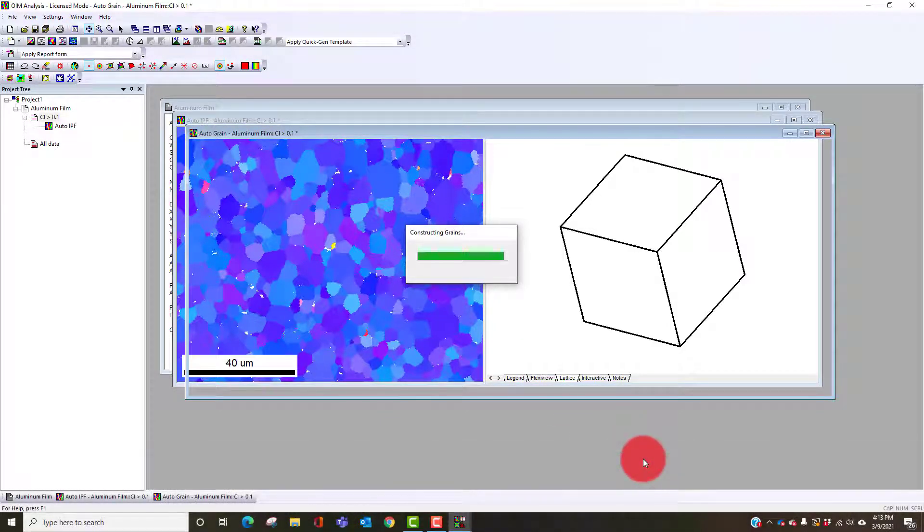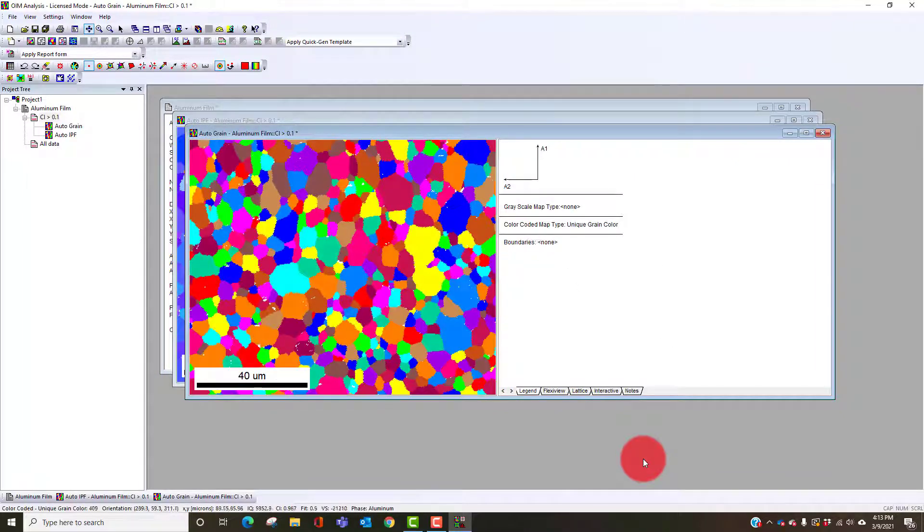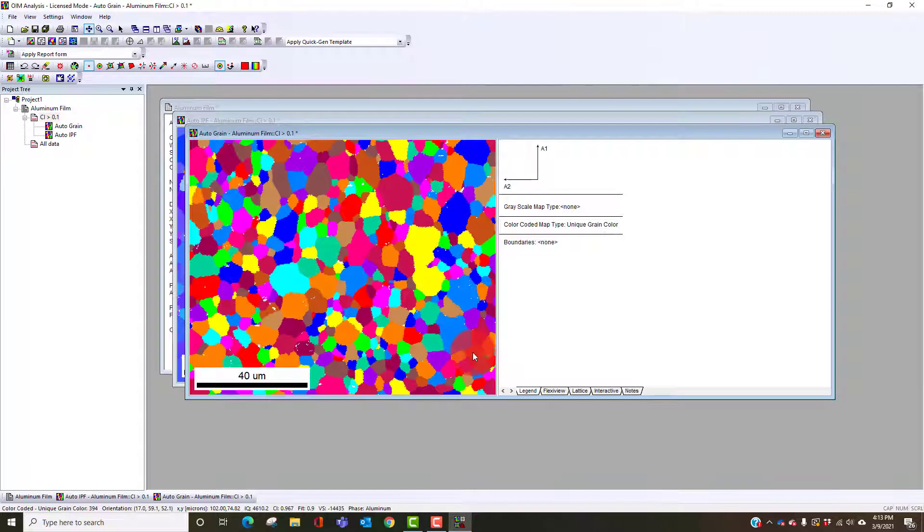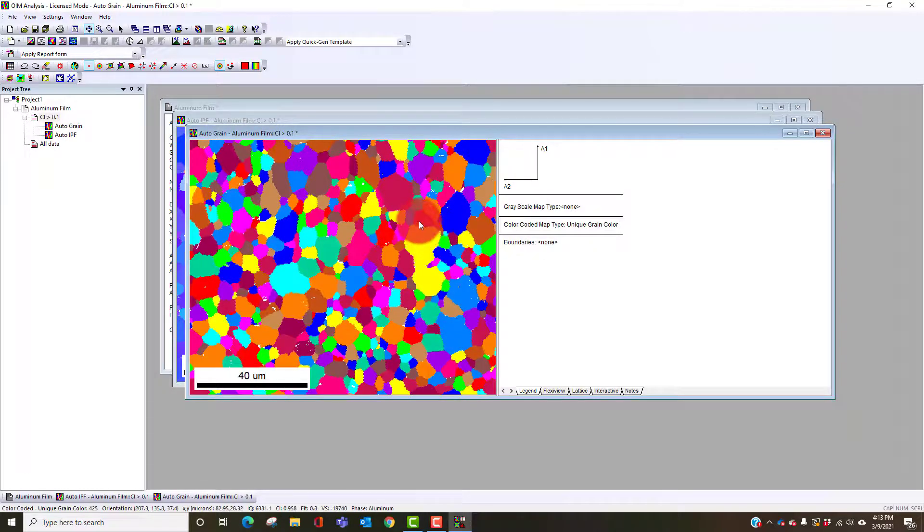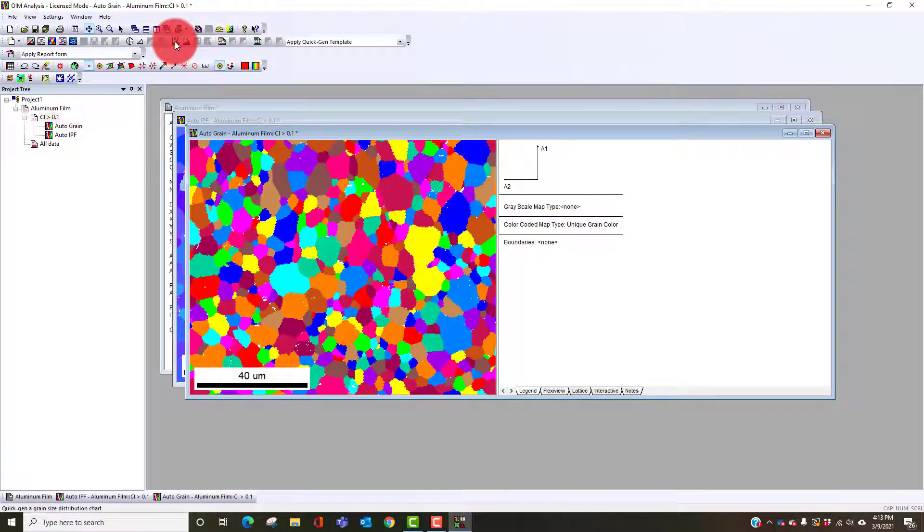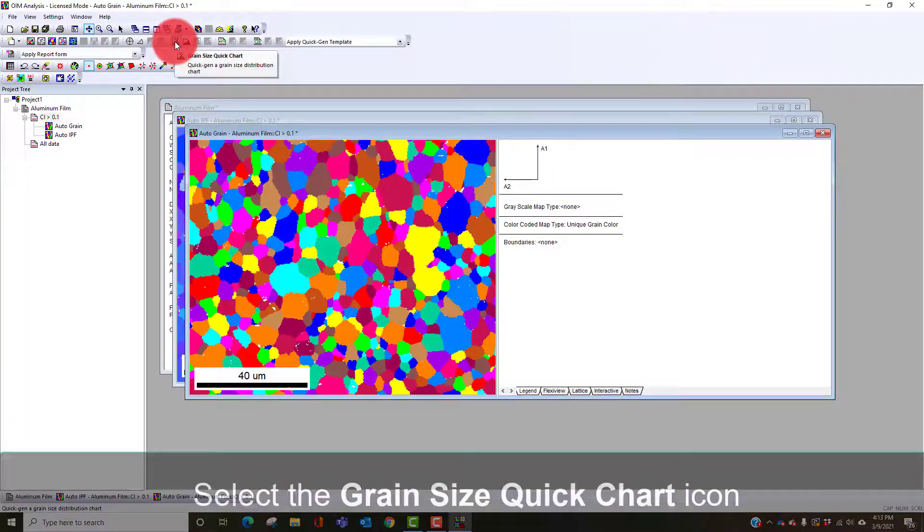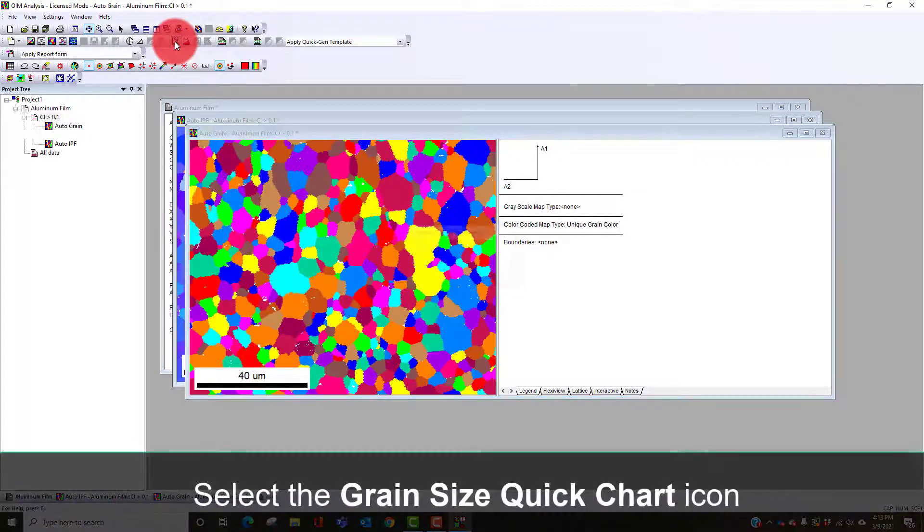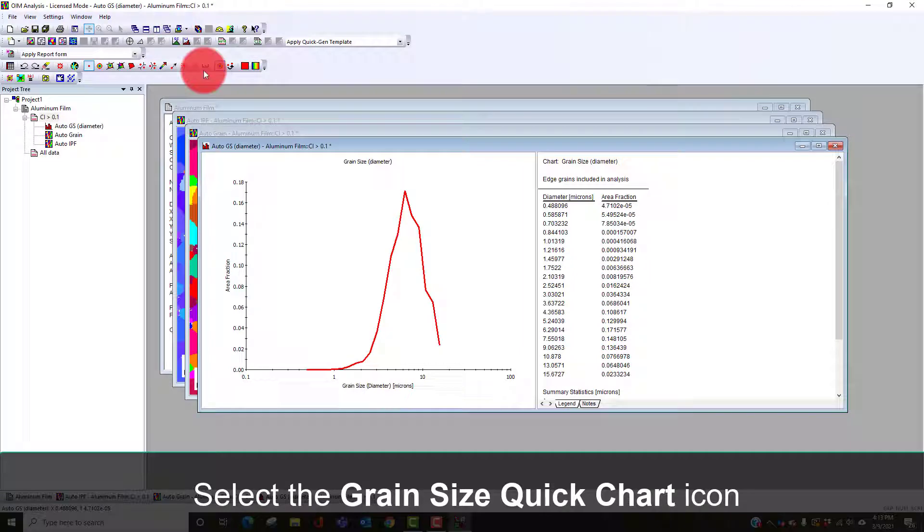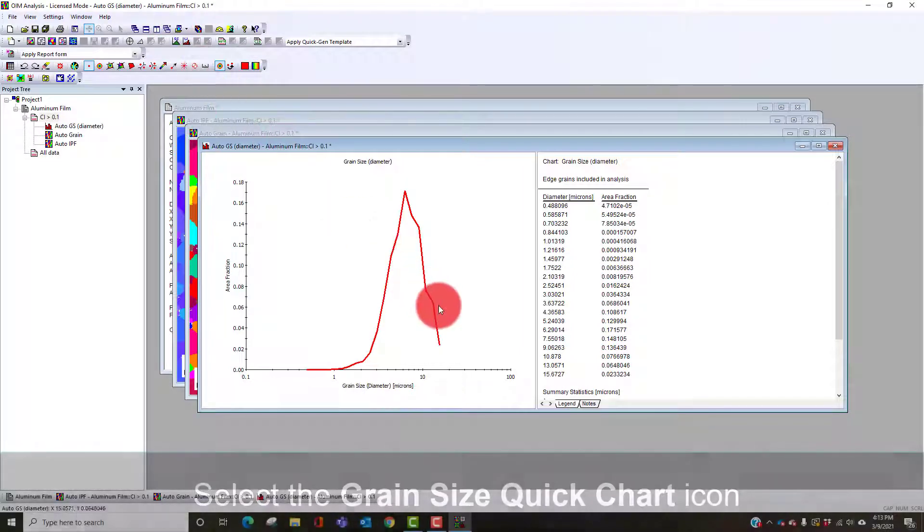It's going to show us a map where the grains are randomly colored, so no two adjacent grains have the same color to show the morphology and the size. We can also easily see the grain size distribution. From the quick gen toolbar here this shows us the grain size histogram.